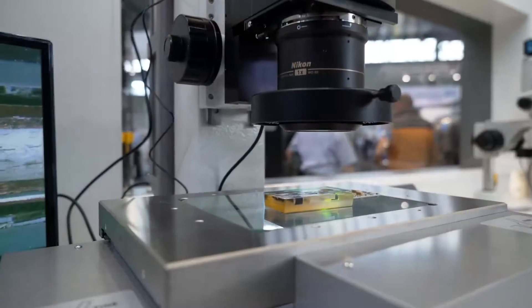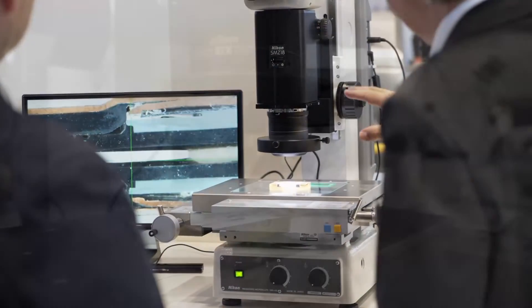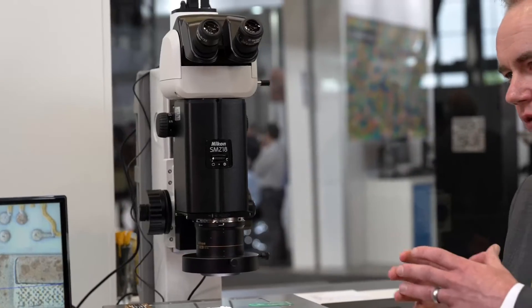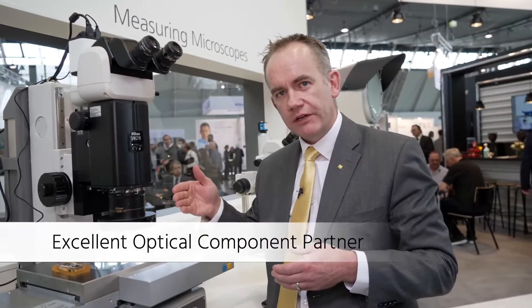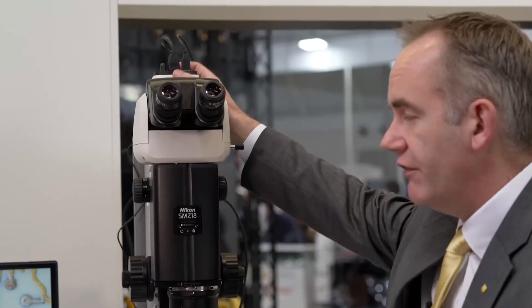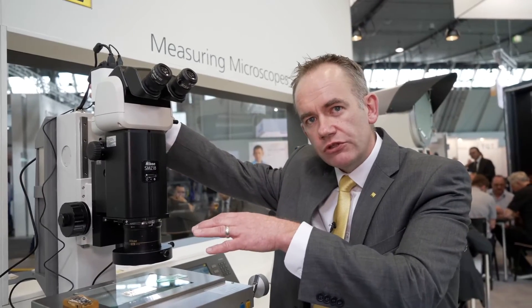On our MM200, rather than the traditional tool makers microscope, we've now introduced the SMZ18 stereo microscope, allowing a much bigger field of view with an AX carrier so the measurement accuracy is maintained. We've also introduced a digital camera with some very smart software solutions.